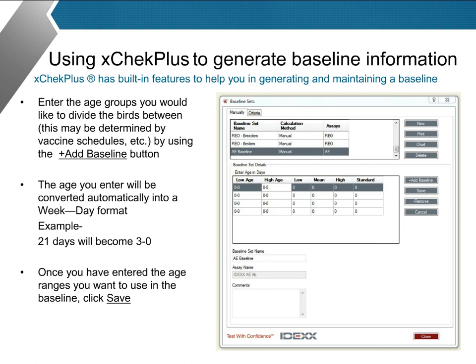Once you've entered in the age ranges you'd like to use, click Save. You can use Add Baseline to enter as many age ranges as you would like to include in your database.